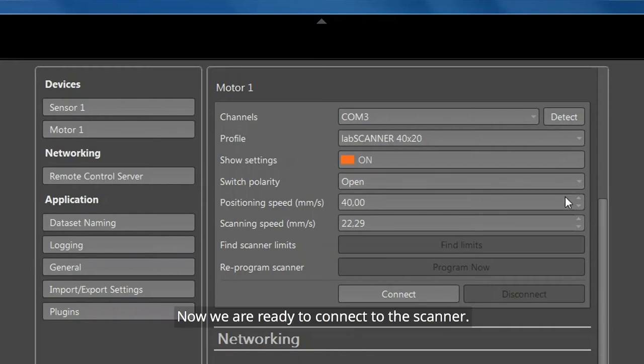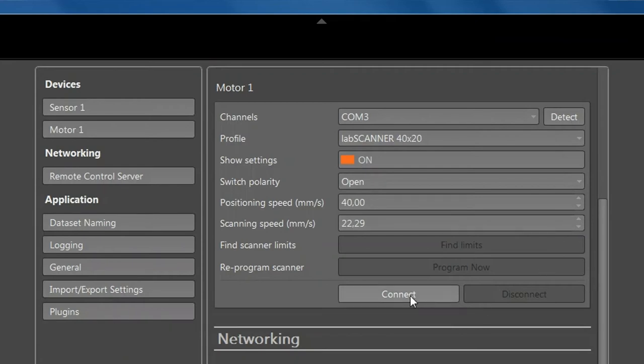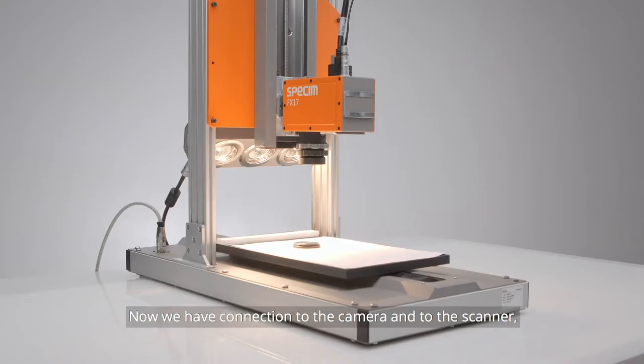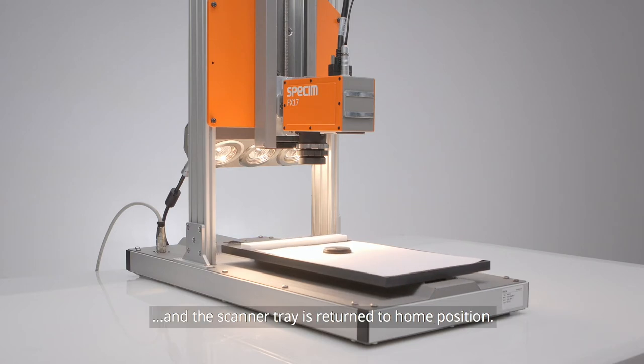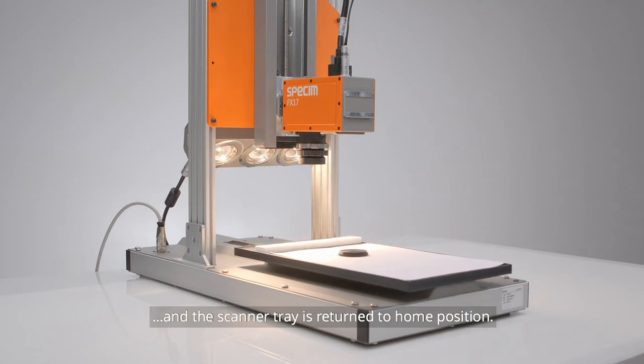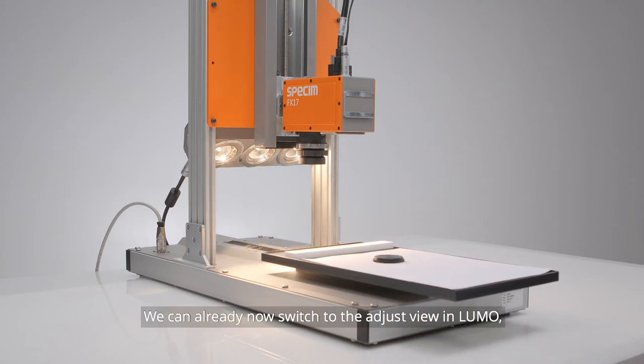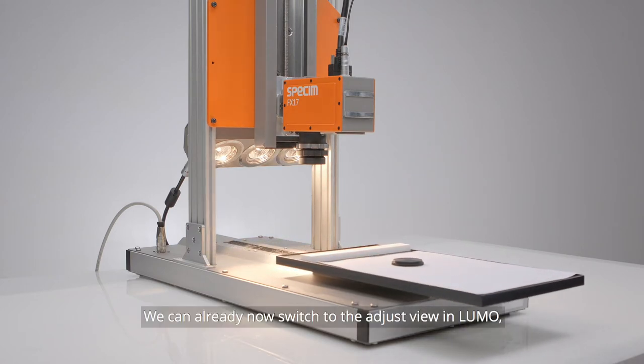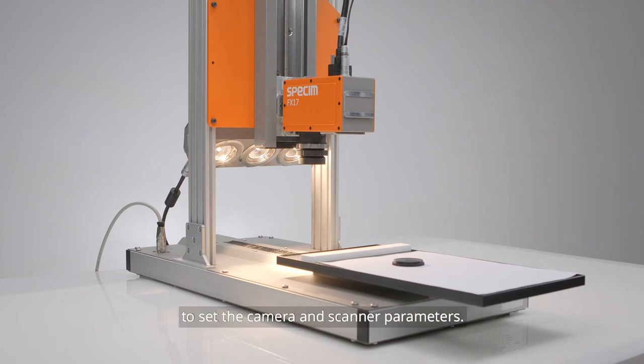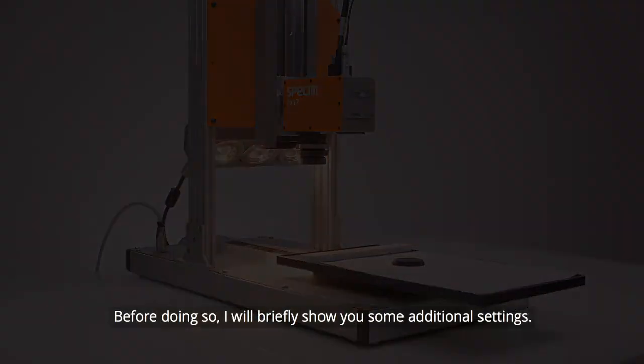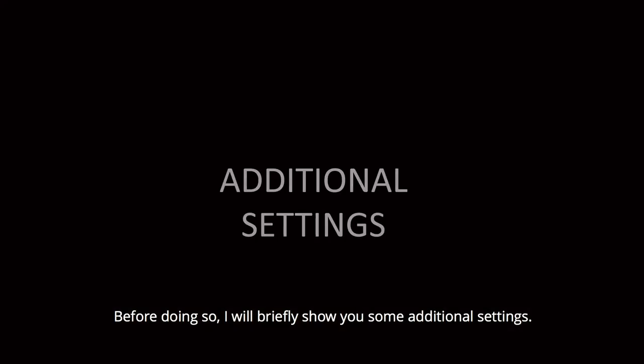Now we are ready to connect to the scanner. We now have a connection to both the camera and the scanner, and the scanner tray is returned to home position. We can now switch to Adjust view in LUMO to set the camera and scanner parameters. Before doing so, I will briefly show you some additional settings.